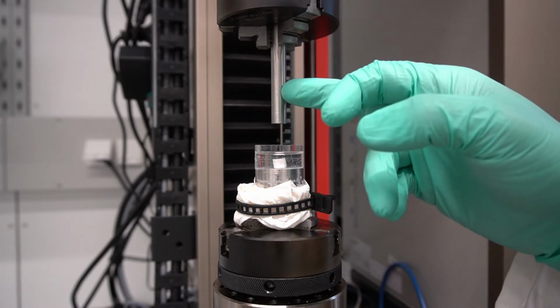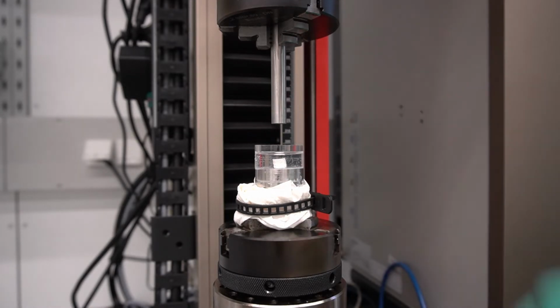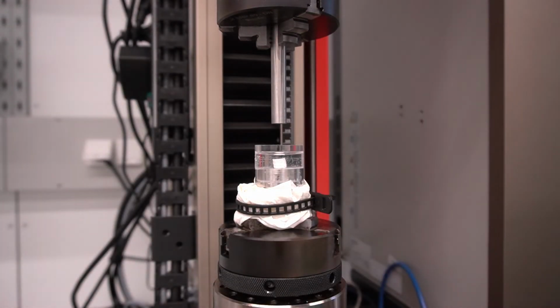And at the top you see a rod, which has a nice perpendicular surface to that surface, and with this rod I'm compressing the sample during the test. So this is a so-called unconfined compression test. That means the sample can expand in circumferential direction as the sample would like. At the top and at the bottom surface the conditions are unfortunately undefined. We have some friction there and also some sliding, but this is how it is when you do mechanical testing of biological tissues. You cannot control everything perfectly. You have to do what is possible.